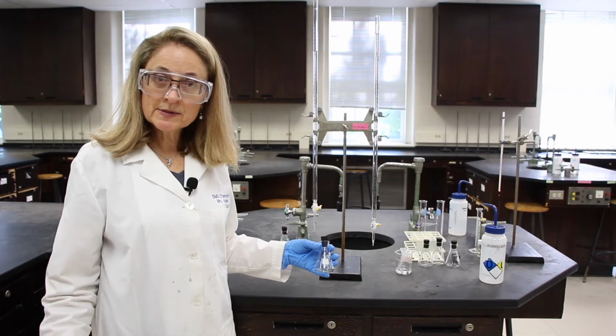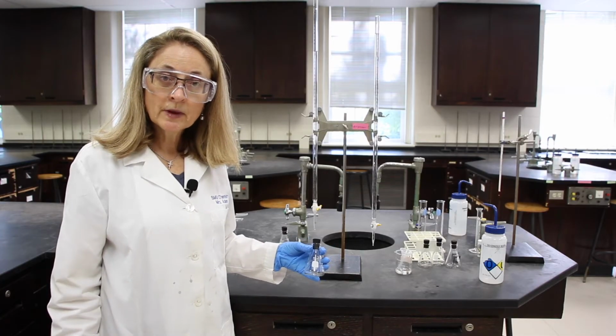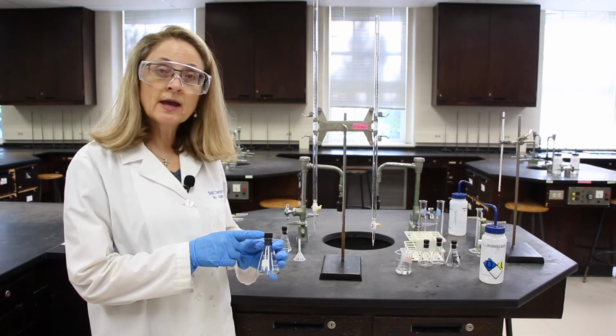Next, we'll repeat this procedure for pure 2-propanol. We'll weigh a flask and a stopper.